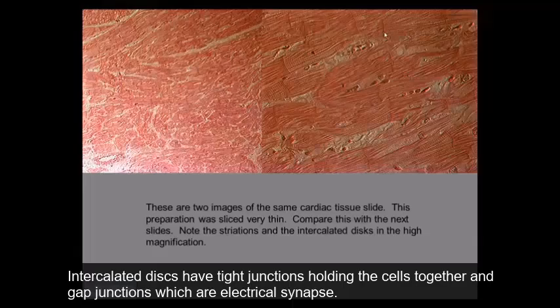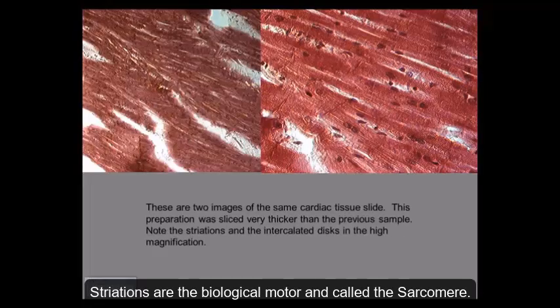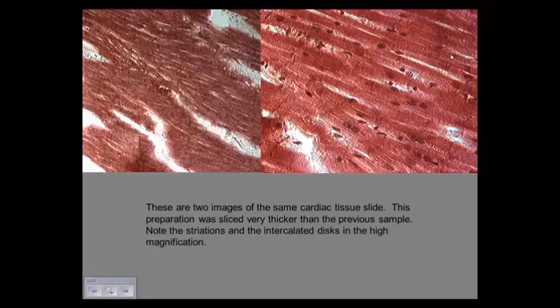Okay? Is that what the vertical lines are? These lines right here are the striations. Right. These thick lines are the intercalated discs. Okay? Here is more cardiac muscle. And you can tell it's cardiac muscle because you can see some intercalated discs. You can also tell it's cardiac muscle because the nuclei are oval, not flat. Okay? And the rest of this cleared area out here, that's artifact. Here it is under low power, here it is under high power.